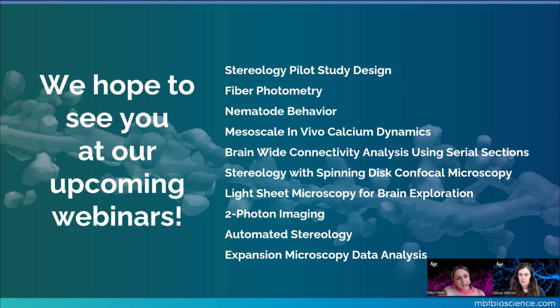If they're in different areas of the image, you might want to use the subvolume tool to isolate certain regions that have fainter signal and use higher sensitivities or different connection criteria for those areas.